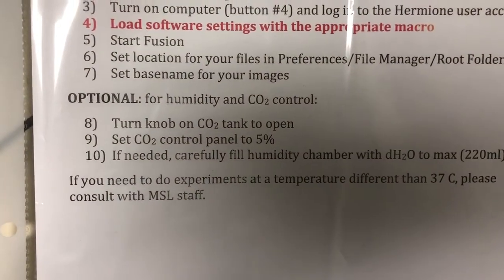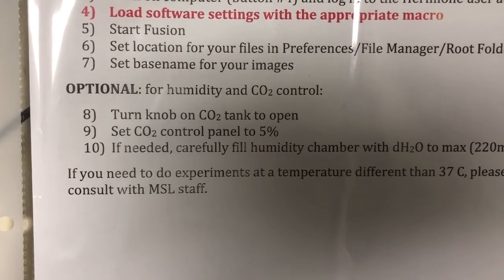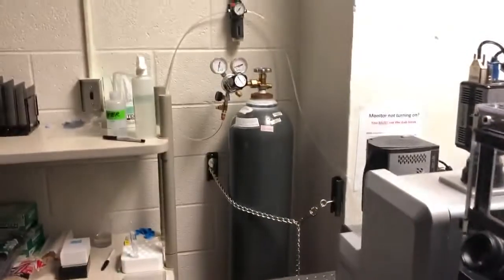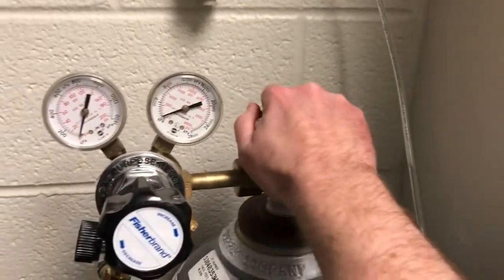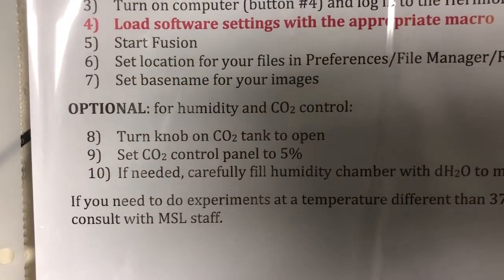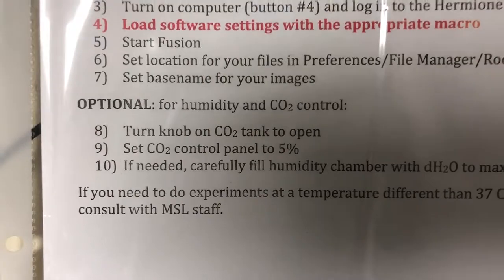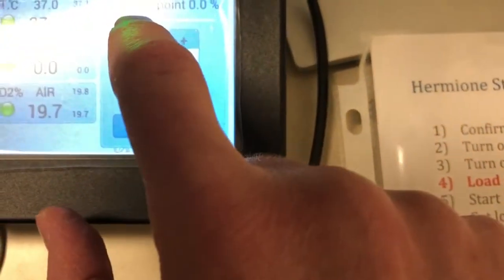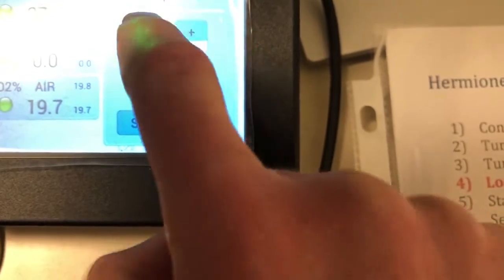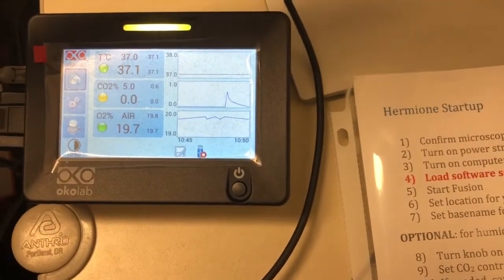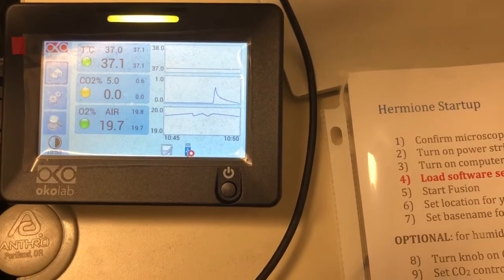The next steps in the startup procedure are optional, and they are for humidity and CO2 control. In step 8, you can turn the knob on the CO2 tank to open it. The CO2 tank is in this corner of the room — turn the knob counterclockwise to open the flow of carbon dioxide. Step 9 is to set the CO2 control panel to 5%. Do that by coming to the control panel, clicking it, and increasing the value until it's at five, then pressing Set. That will make the system equilibrate the CO2 to five percent output.